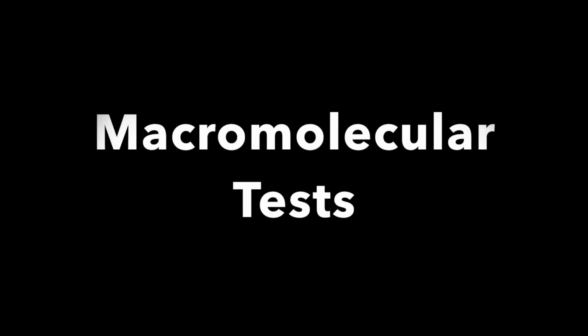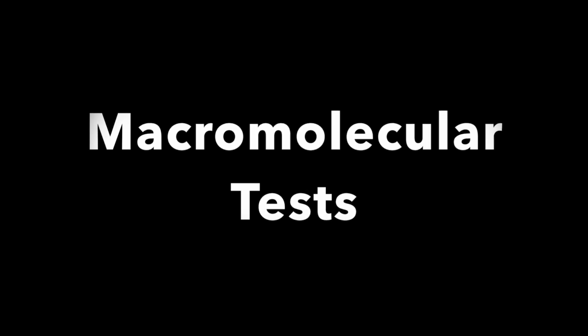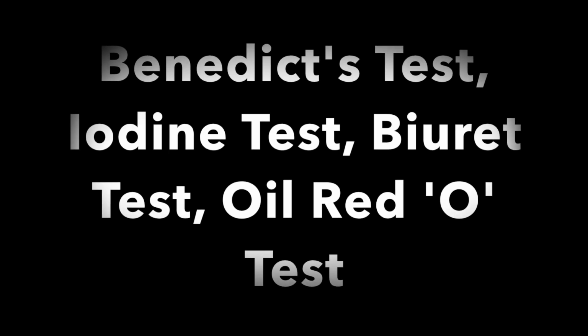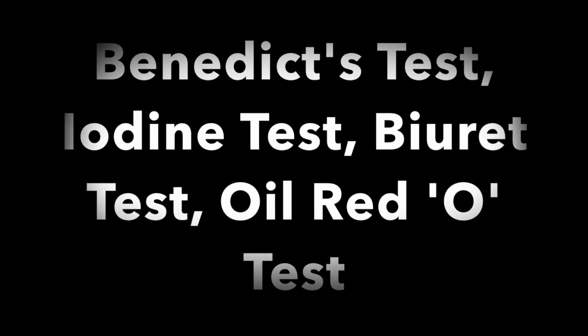You will be using simple tests that indicate the presence of various macromolecular groups. These are what we call colorimetric tests, because of the response of the agent to the chemical group it reacts with results in a specific change in the color from that of the original solution. First, you will be determining what a positive and negative response is for each test using samples of known macromolecules, one corresponding to each test.